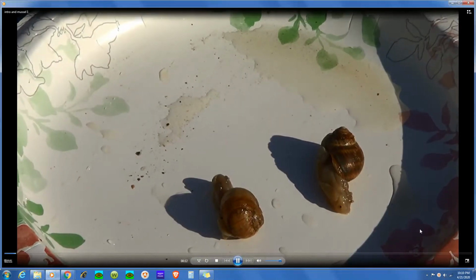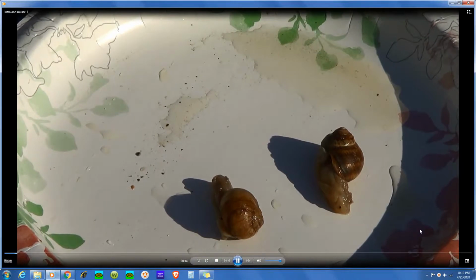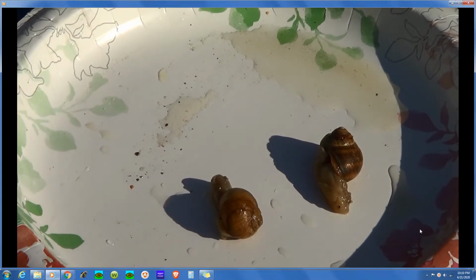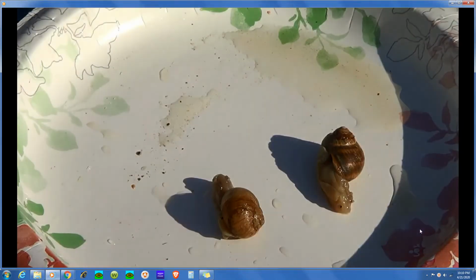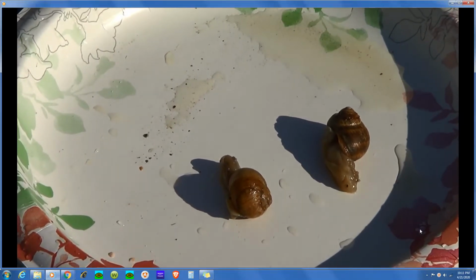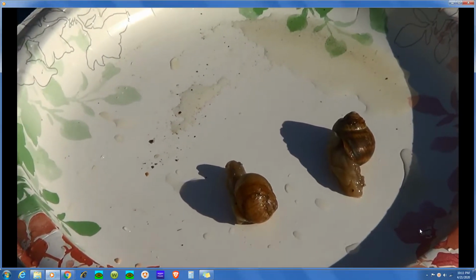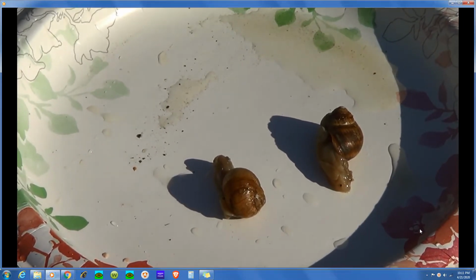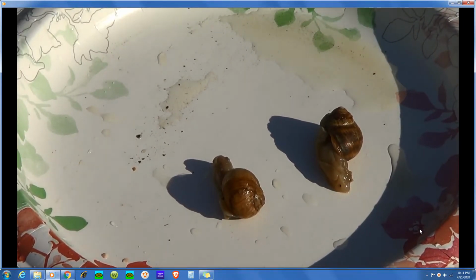Okay, so I scavenged some mollusks from the dissection specimens over at the high school before, when we got a chance to go back into the room for a little while. And so I'm going to do some demonstration dissections. I know we would have preferred to have this be you doing your own dissections, but it is what it is. I'm out in the backyard.